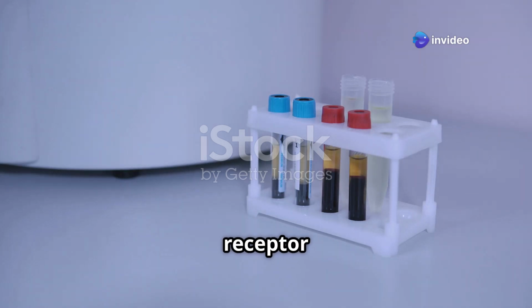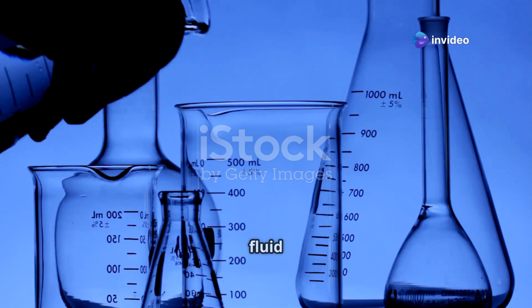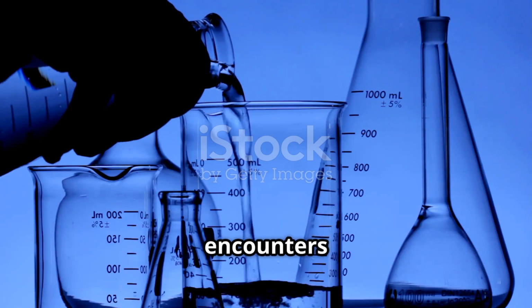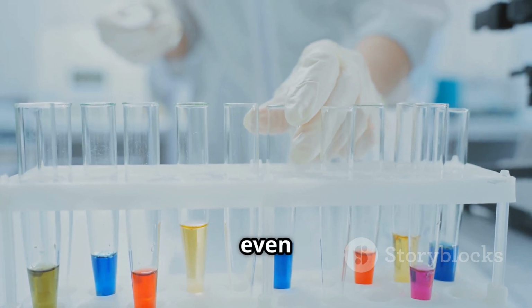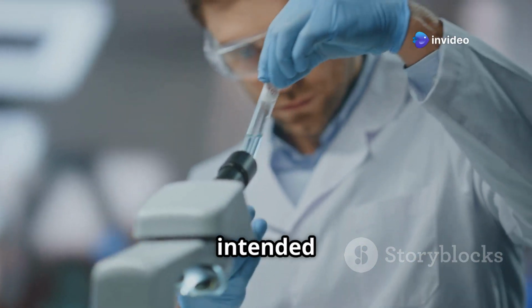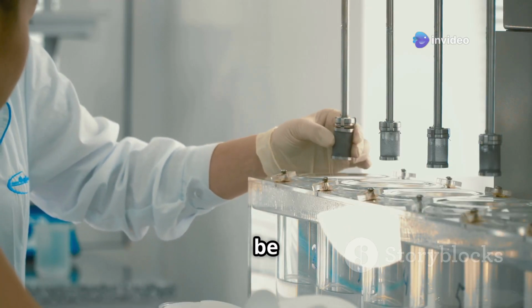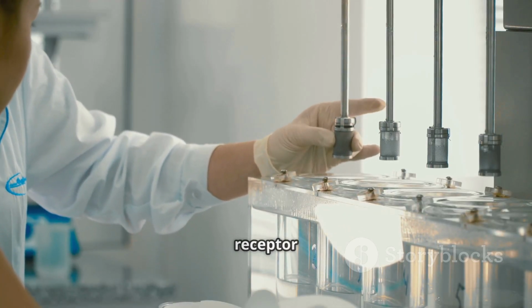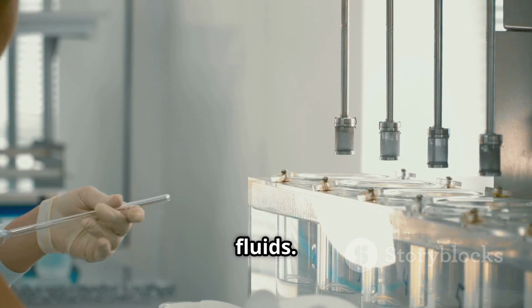Choosing the correct receptor media is crucial for successful IVRT. The receptor media is the fluid that mimics the environment the drug encounters in the body. This could be the fluids in the stomach, intestines, or even the bloodstream. The right receptor media depends on the type of drug and its intended route of administration. For example, if we're testing a drug designed to be absorbed in the stomach, we would use a receptor media with a pH similar to that of gastric fluids.